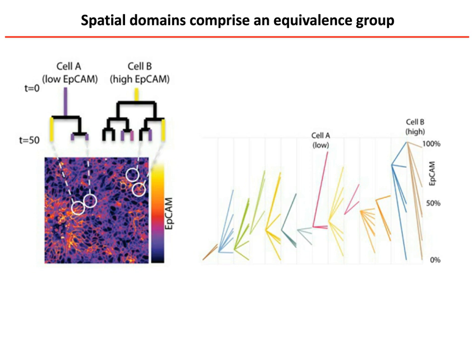So it starts at a medium level, and there's 1 high daughter and 2 low. And cell B is the highest one I could find in the field, and it gives rise to a range of signals at the end. So the point of all this analysis is that this system is unstable.